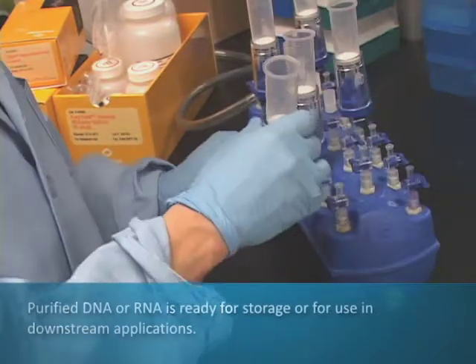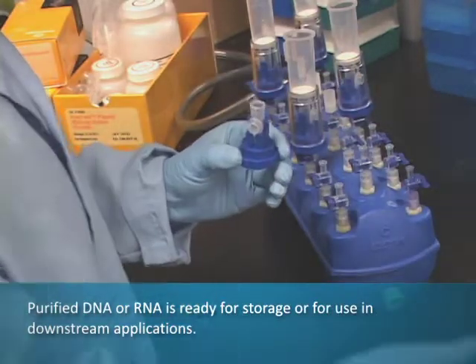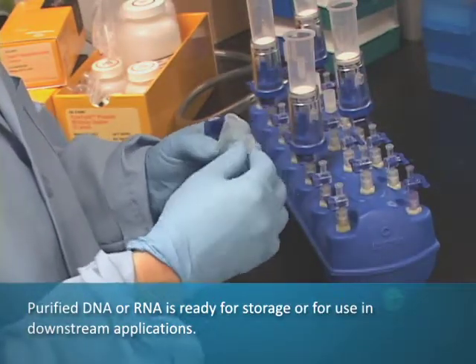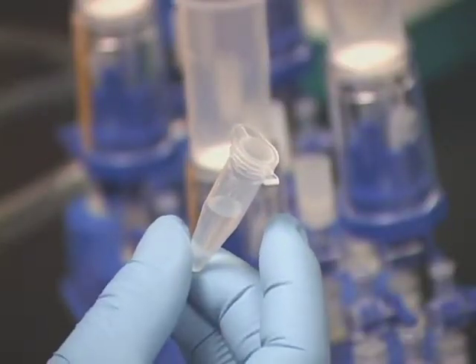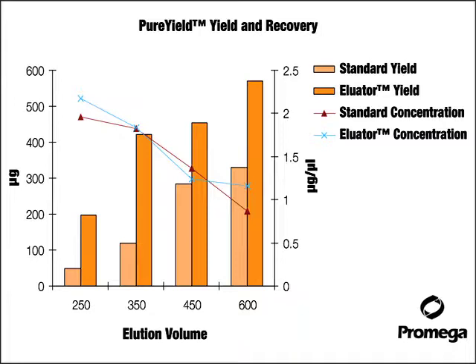The device is disassembled and the plasma DNA or RNA is ready for quantitation or use. The use of the Eluator vacuum elution device reduces the dead volume of column purification, allowing more efficient elution of nucleic acid.